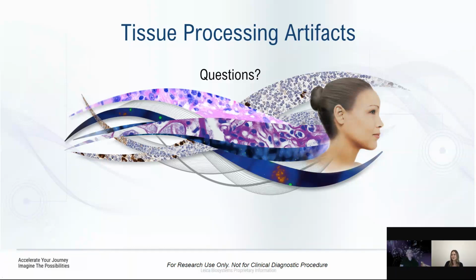Robin, my first question for you asks, what exactly does chatter mean? Chatter can mean several things in histology, Kaylee. One of the things I had mentioned in the presentation is that if tissue is overprocessed, of course, it becomes very dry, especially those types of tissue that don't have a lot of supporting fibrous or fatty tissue. A colon is a perfect example. Those small biopsies can become overprocessed, become too dry, and even with some hydration, you can't seem to get very far in before you have this chatter.